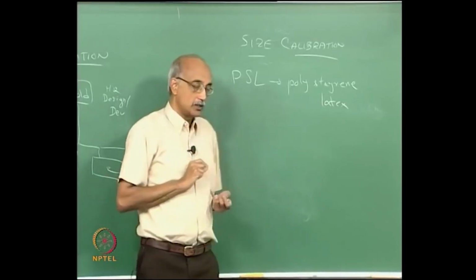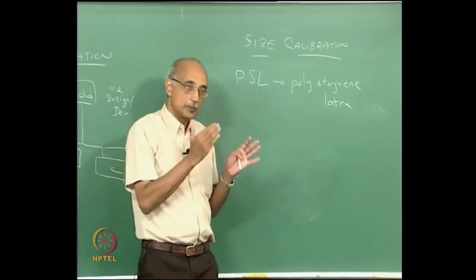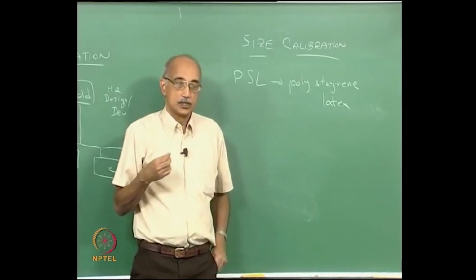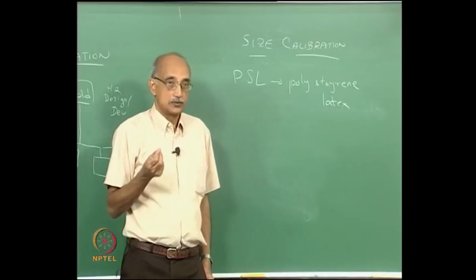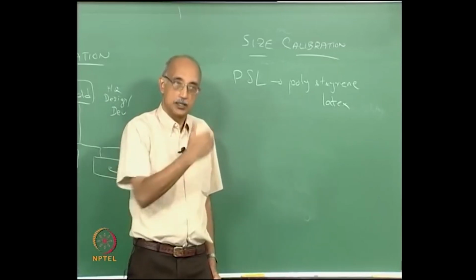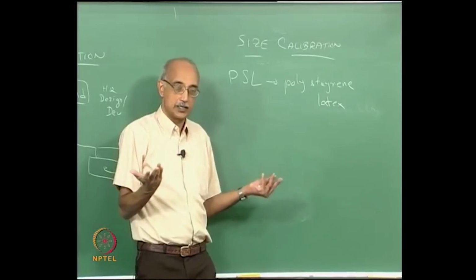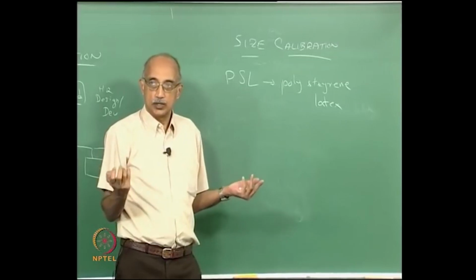So the PSL particles offer the excellent benefit that you can not only prepare a polydispersed solution, but you can also prepare monodispersed solutions in a very, very wide size range. PSL is a plastic material, and it has light scattering, light absorption, refractive index characteristics of a plastic particle. So when you use PSL as your calibration standard, it does have all these advantages, but let us say that your sample itself is alumina, and you are using PSL to standardize or to calibrate the particle counter or particle size analyzer that you are going to use for alumina.